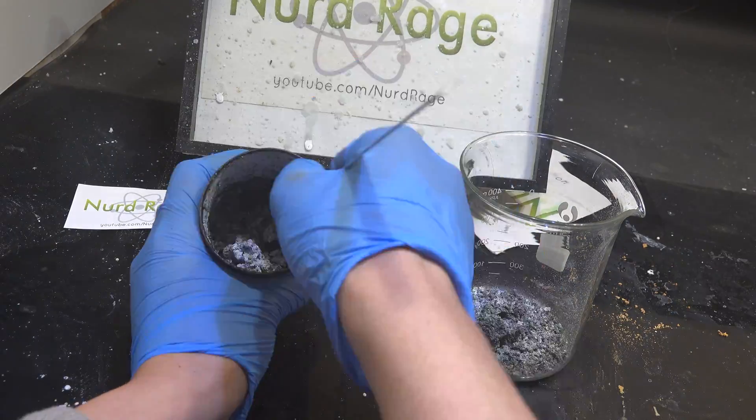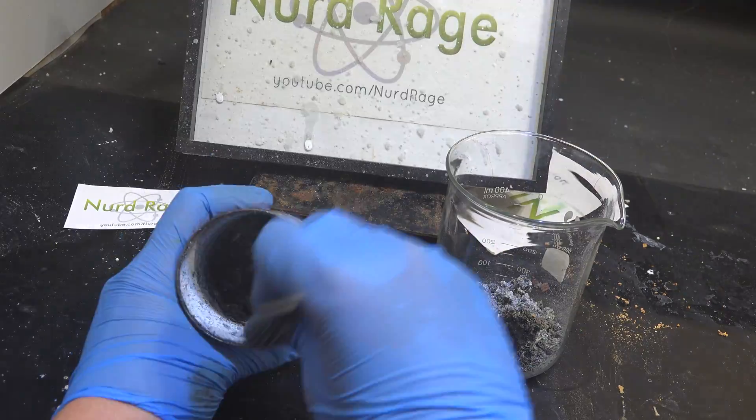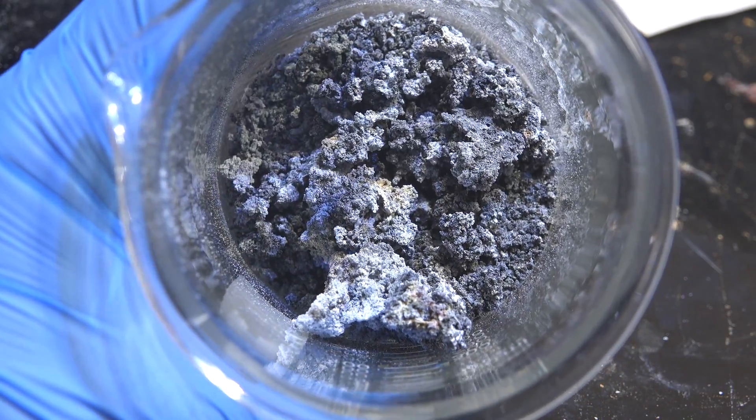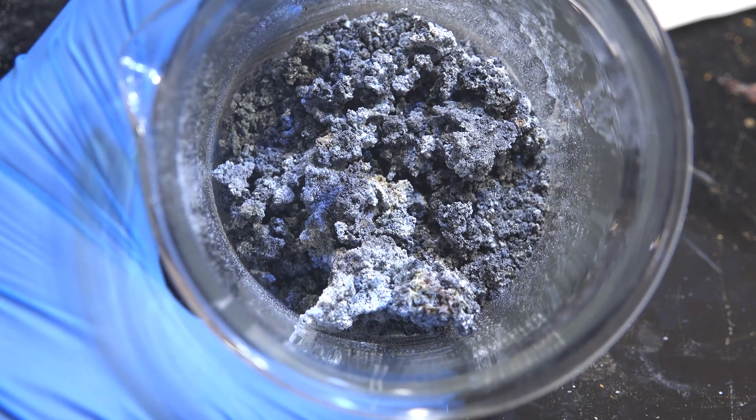Now using a chisel or metal strip, break out the aggregate of sodium magnesium oxide. And there it is. Now it doesn't look like sodium, but it's very reactive. Let me show you.